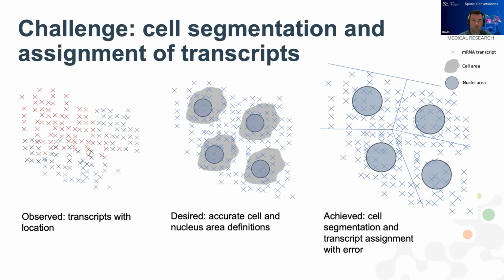We can do a better job of defining what we observe as the boundaries of a cell, and that will immediately help with transcript assignment. But in these tissues where we take a small slice and put them on the slide and record XY coordinates for observed transcripts with a minimal Z dimension, there's also the challenge of just having cells that overlap each other. And so when we look from top down, down the Z-axis into the XY plane, then we might have partial areas of cells that overlap with better defined cells.